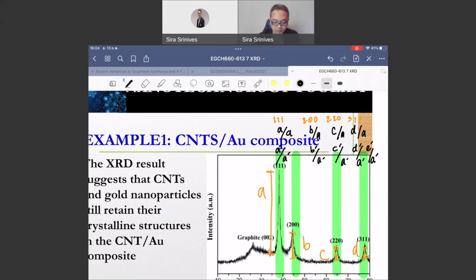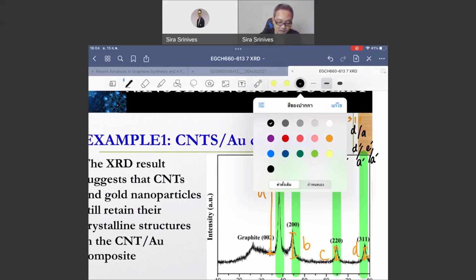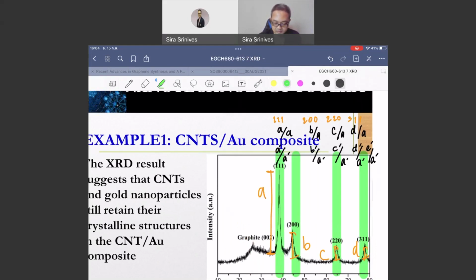And if I can prove mathematically that these two have just about the same number, the ratio being determined here would end up closest to one another. I would say that these two experiments have gold nanoparticles with similar crystal structure to one another.